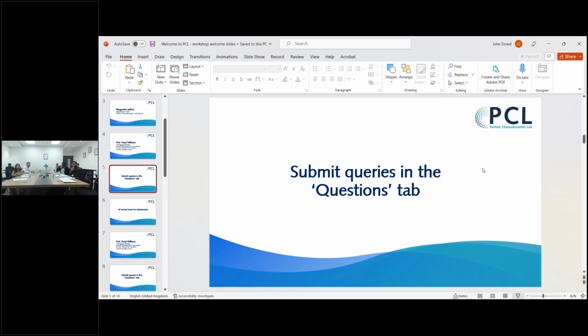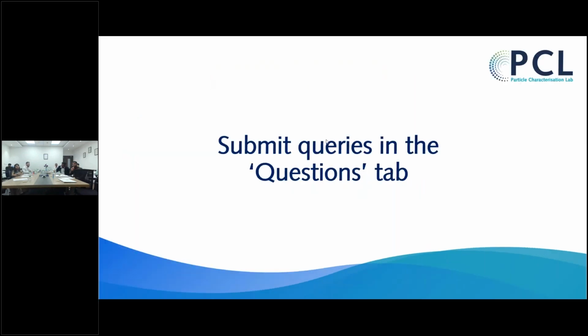Darrell, there's a question that just came on the chat, so I'll just read that out loud for you. It says, how can you reduce the caking effect in powders, just in general? Sure. Well, the first thing you do is understand what causes it. If you don't understand what causes it, you can't get rid of it. So my first suggestion was you need to understand what is causing it and or which component is causing it. If I was doing a study, I would be looking at the powder rheology of my component in my formulation to identify which component is causing the caking. And that's where I'd start.